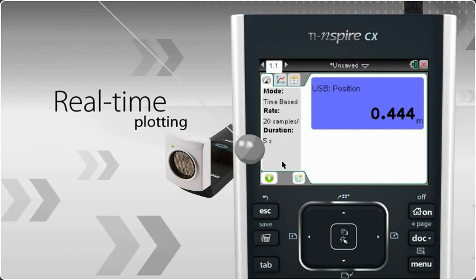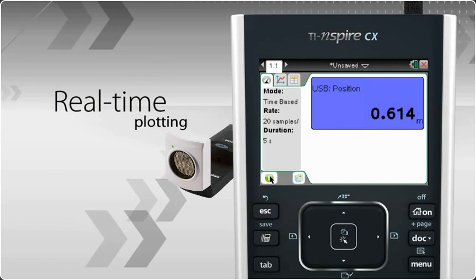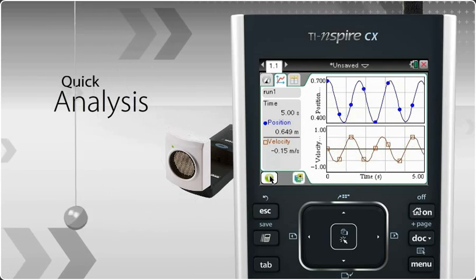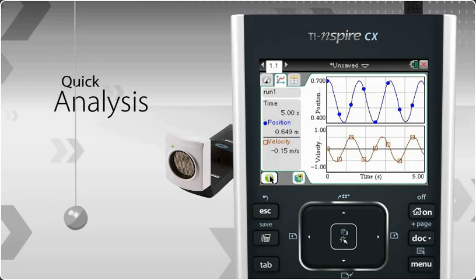Students can watch a graph plotted while data collection is taking place, all in real time. The TI-Inspire CX handheld gets you to data analysis more quickly and offers the advantage of a full-color display to help students visualize concepts and relationships.